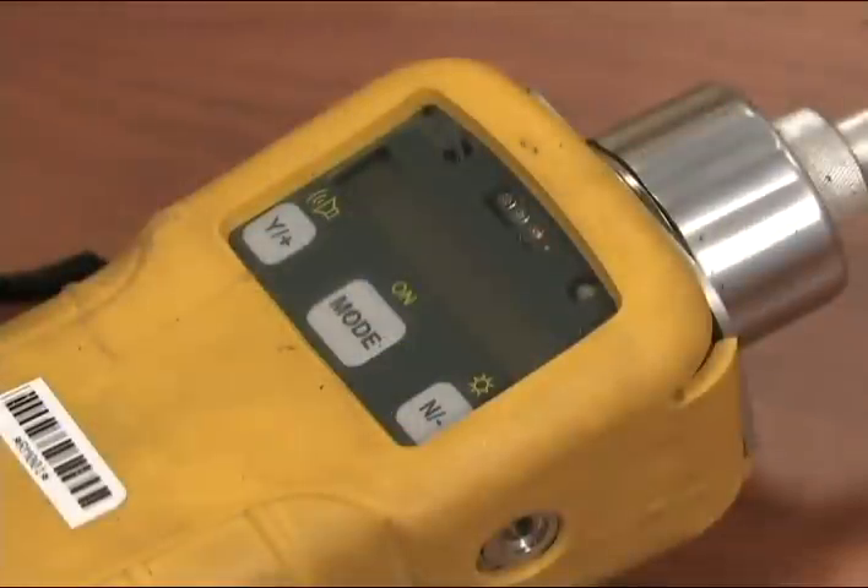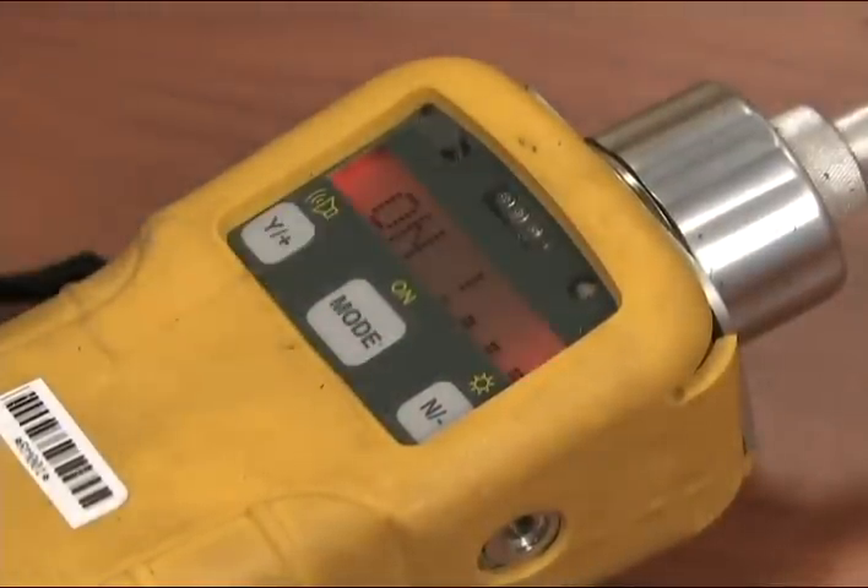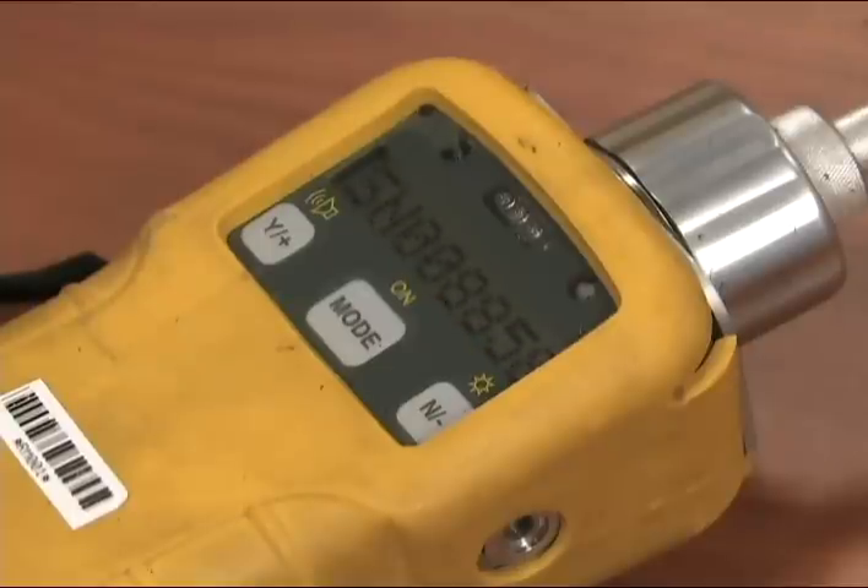To get started, push the on button and allow the unit to go through a minute of diagnostics checks. This will take approximately two minutes to complete.